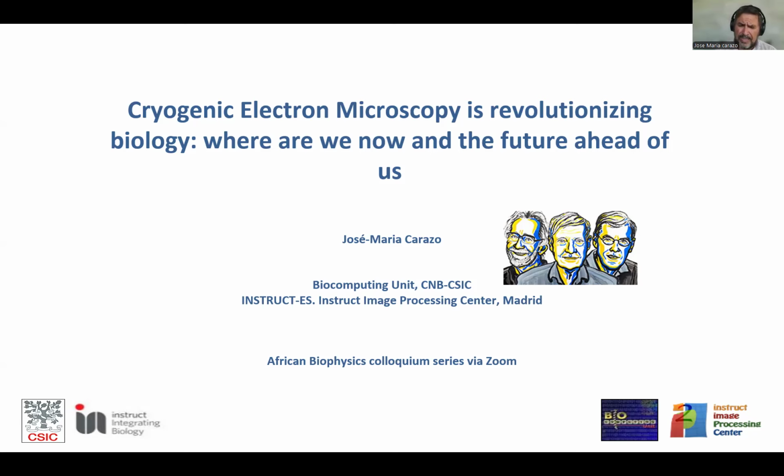You are saying that there is no that type of microscopy in Africa. In South America, except for Brazil, which has several, there is no other microscope. However, there are fantastic scientific communities in a number of countries, and what we are organizing are ways to first go to negative stain, understand negative stain, because this is what you would do in a normal lab.